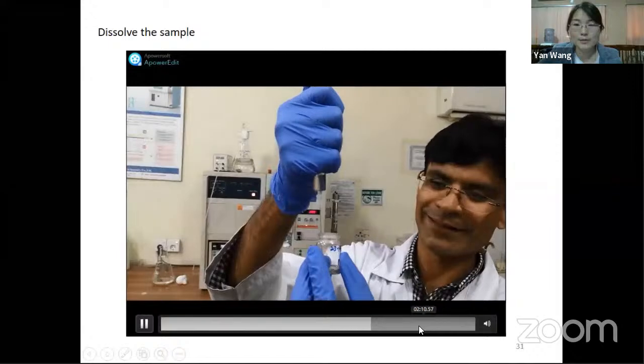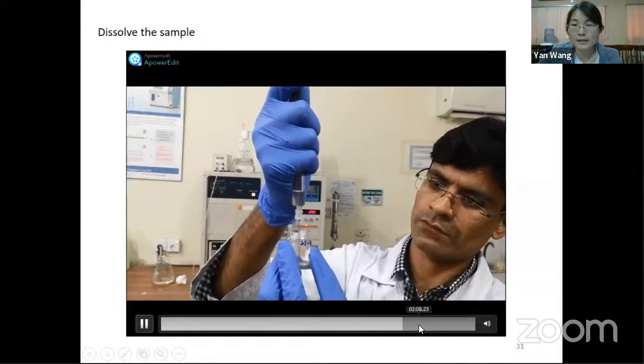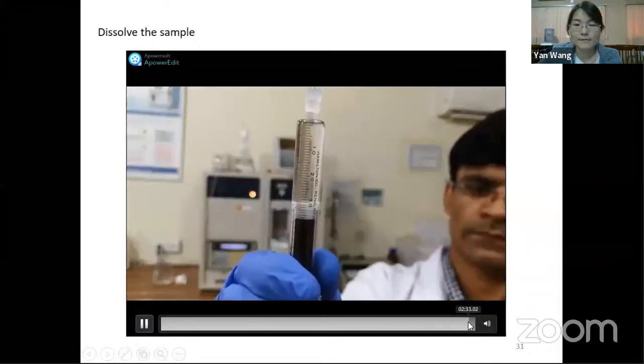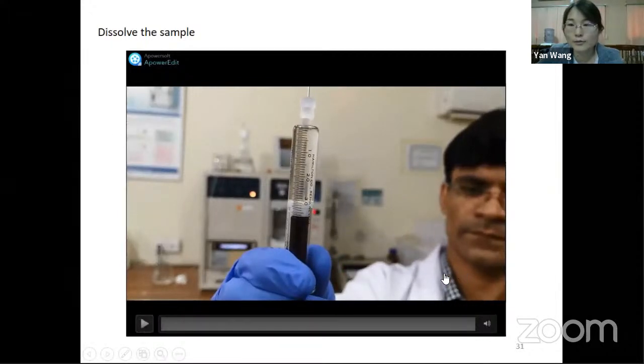And now the sample should be dissolved properly into a clear solution, right? And he's showing this volume, 3 ml, because the injection loop is 3 ml.